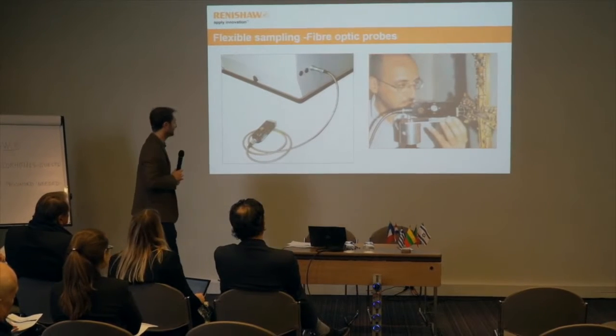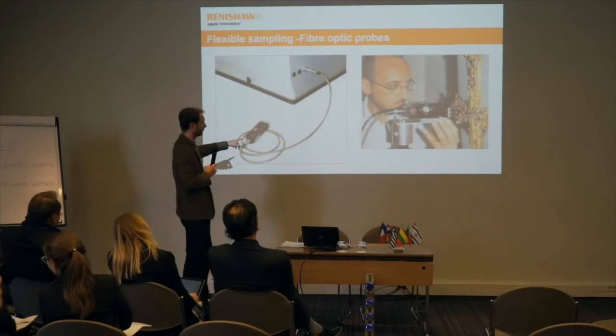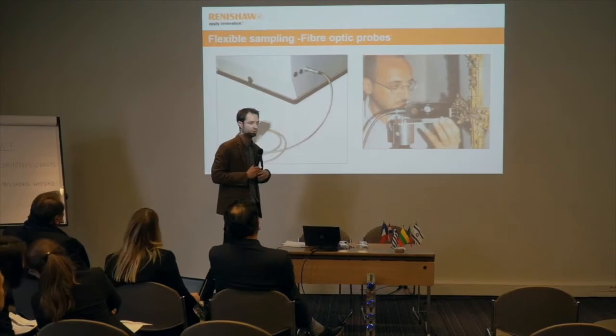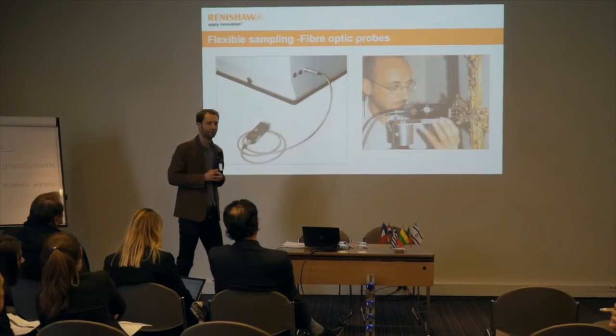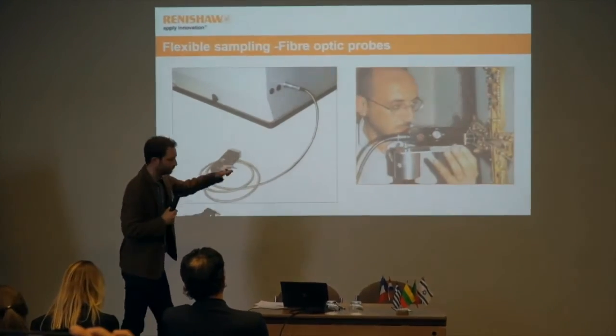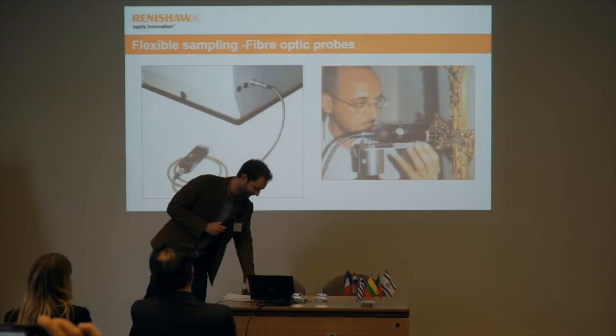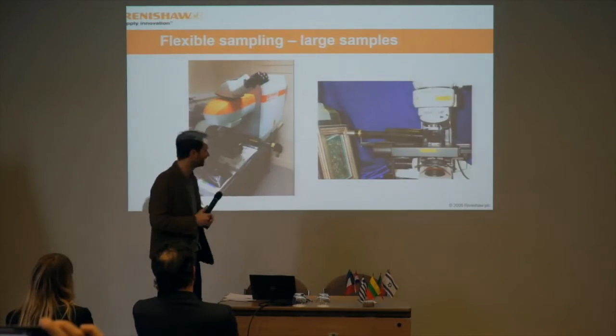Also, there is flexible sampling, so you can connect an optical fiber and directly measure further away, in situ, your sample. This is not a very good practice. You should be really wearing laser safety eyewear, but that's the way it works.